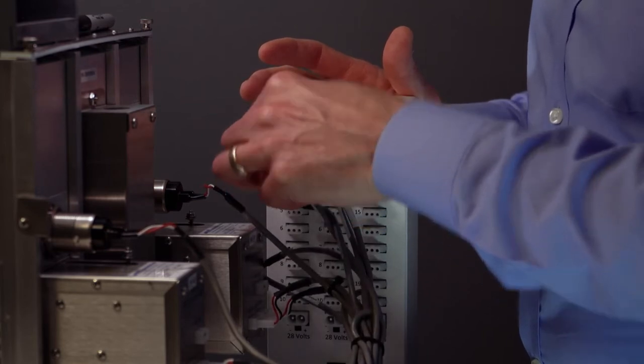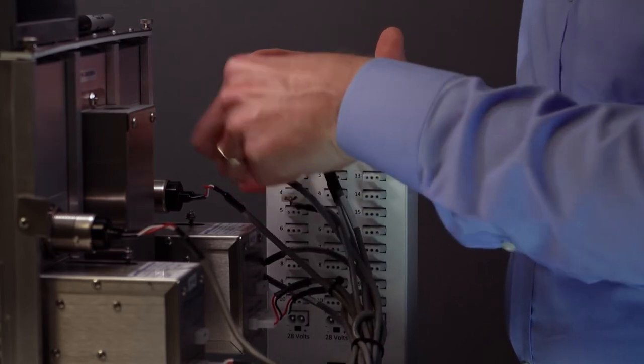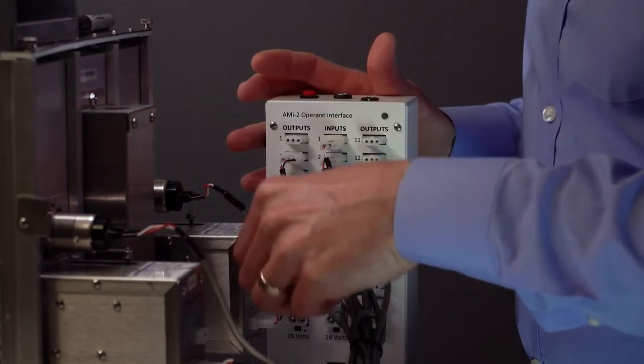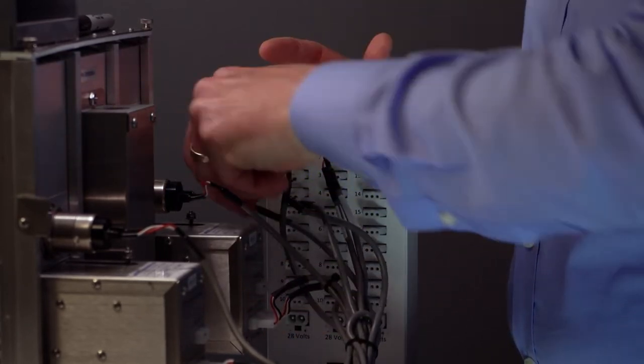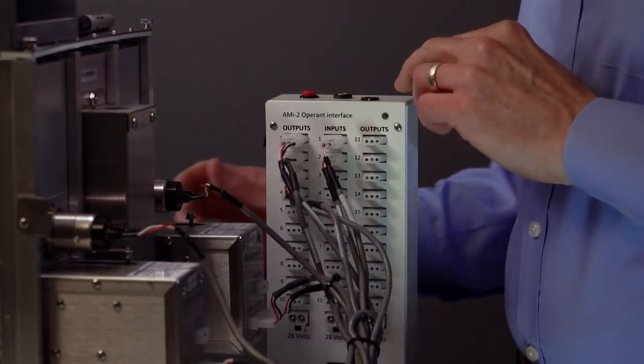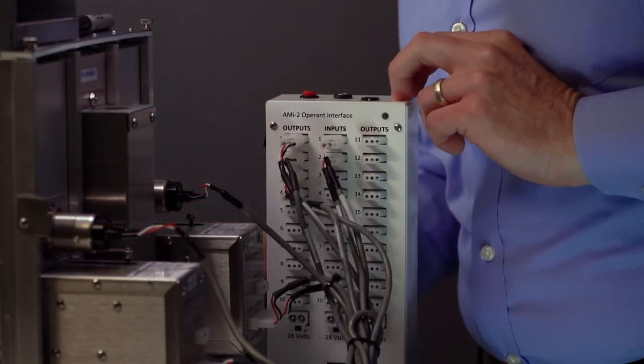However, once you choose which connector to plug into, you're going to want to mark that and indicate so you know that for configuration within the software. Once we have all those connectors connected, we're now going to power this up.